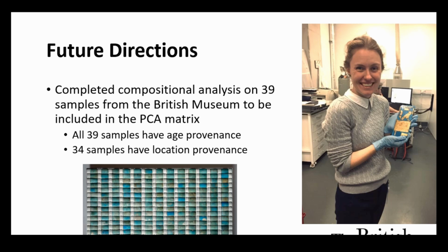Kind of in conclusion, I'd like to really highlight the fact that we can take a sample such as faience. It's kind of regarded as low value. It's not glitzy, it's not glamorous, it's not the holy grail, it's just ceramic, it's a bit like pottery. But if we get these huge collections, which we all have, we have huge databases of coins, pottery, faience, ceramics, we can reinterpret the data and we can look at it differently by starting to look at the whole data set as opposed to perhaps just things from Cairo or just things from Thebes or whatever it happens to be.